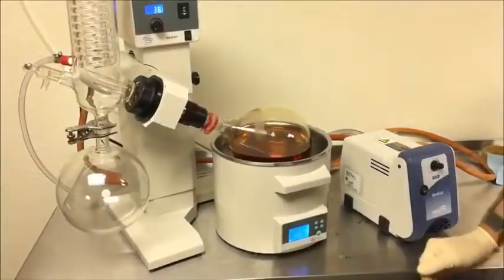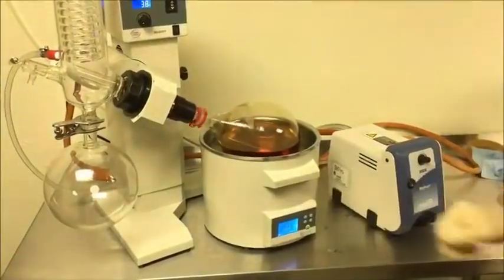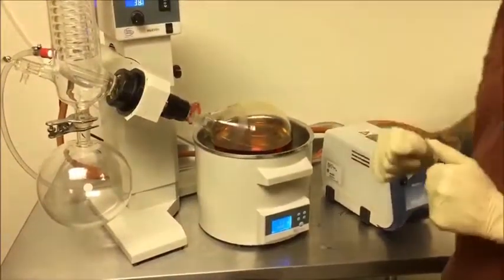So now it's just a waiting game. We have a slow turn here. We have our hot water bath set at 37°C. We have our vacuum turned on. We're just going to sit and wait.